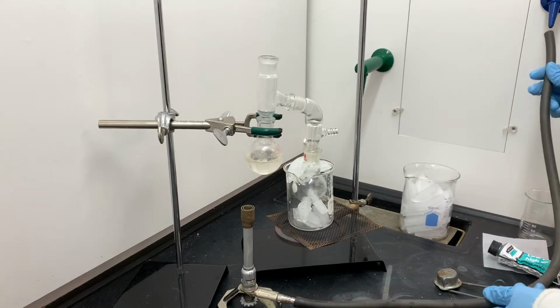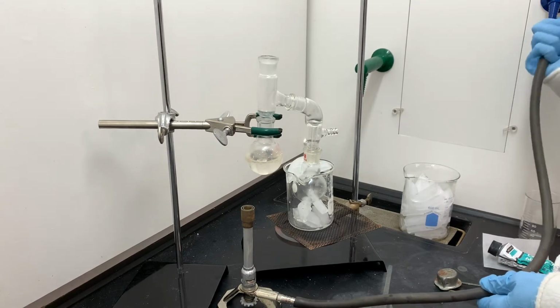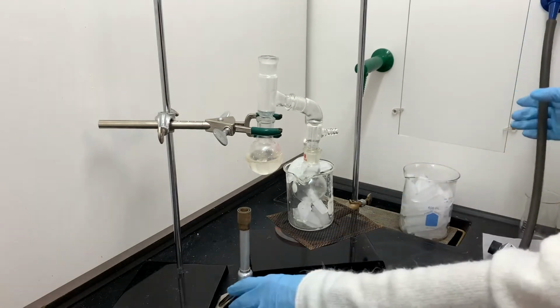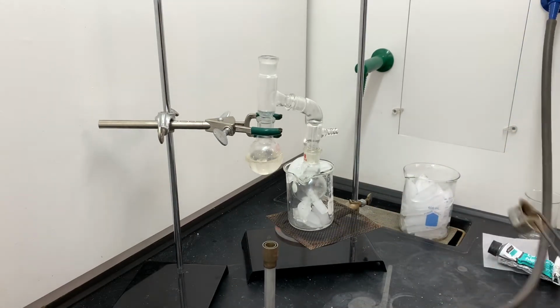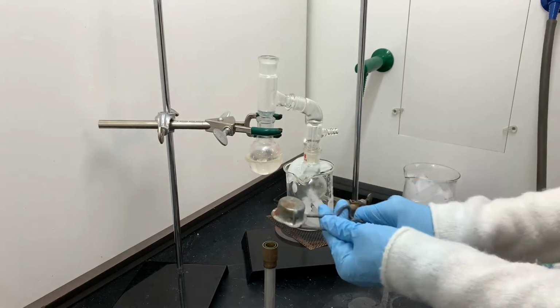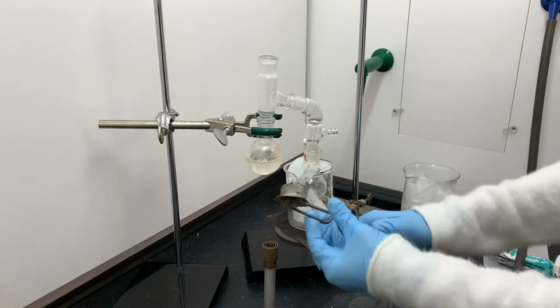It's time to connect the Bunsen burner. Bunsen burners in fume hoods are sometimes a little bit tricky. The ventilation makes it sometimes a little hard to light them and to keep them lit, and you'll see that I'll struggle with that a little bit initially here.